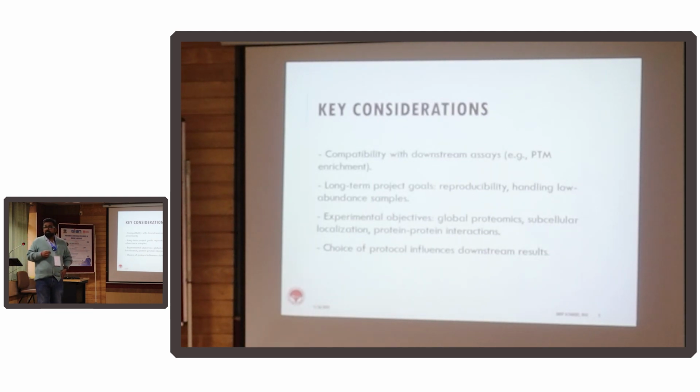Handling low abundance. Sometimes, like for the COVID work that we did at IIT Bombay, we wanted to detect the COVID virus in the viral transport media, VTM. Now VTM is 5 ml, 6 ml. They push a swab into your nose, reaching here, in the upper palate. How many viruses does it catch? Maybe a few million, but viruses are very small. So most of the VTM is primarily the VTM. It has lots of bovine serum albumin, and even cells from your own body have become part of the VTM. To find the viral protein from there, you have to do some sort of enrichment.